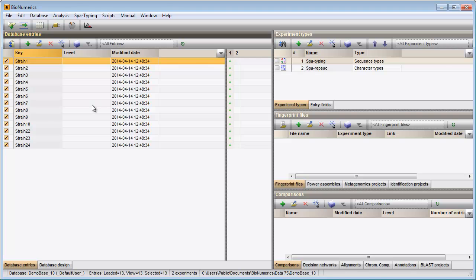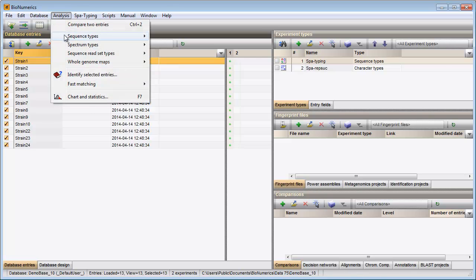The window can be called again with the menu item, analysis, sequence types, batch assembly reports.